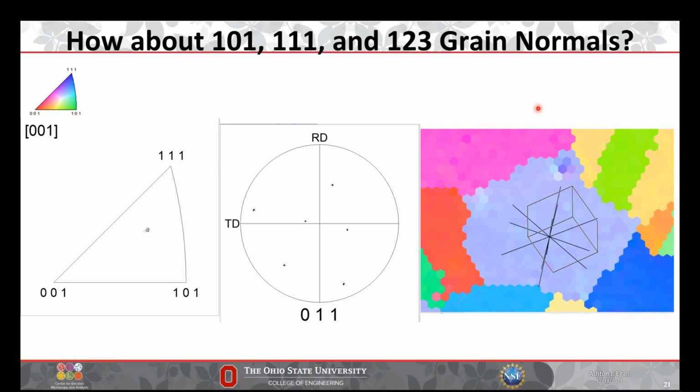And you can do this with basically any zone axis you want to and any sort of crystal system you want to. You can just ask OIM software to do it for you. Instead of staring at pole figures for a long time and trying to guess, okay, well, this is the way I need to draw this, or trying to find a magic grain that lines up either horizontally or vertically based on the other two orthogonal directions from the beam direction.